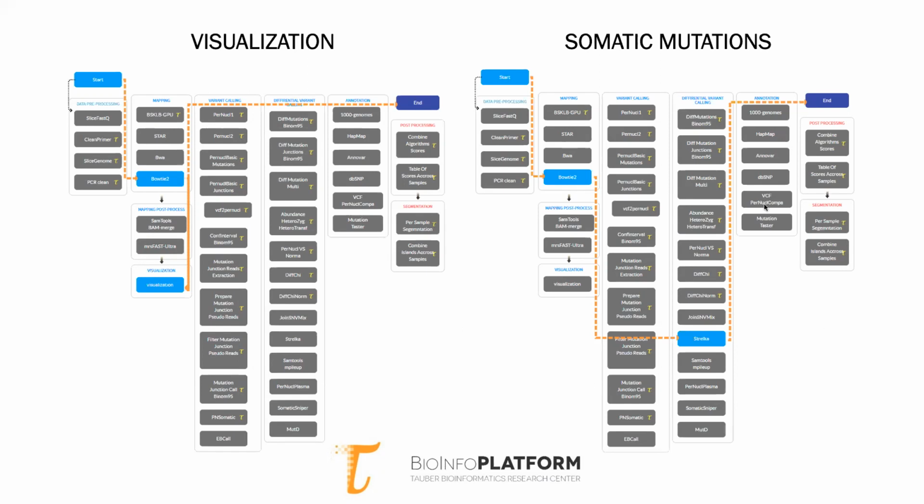And here, an ability to detect only somatic mutations. So those somatic mutations allow us to detect specific variants that are present in only the cancer or the tumor sample by subtracting everything else that is normal to that person that represents the germline mutations.